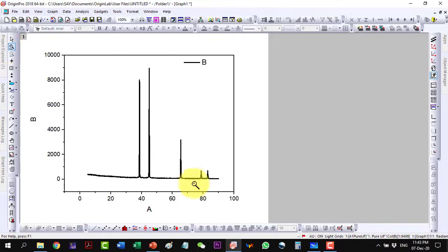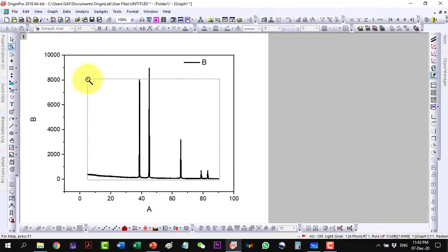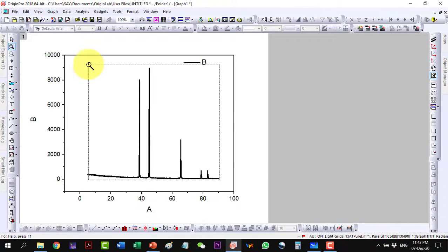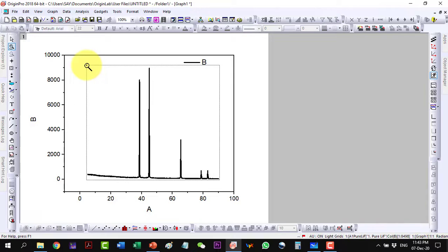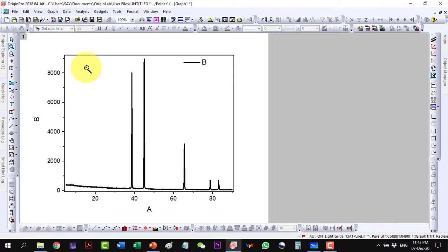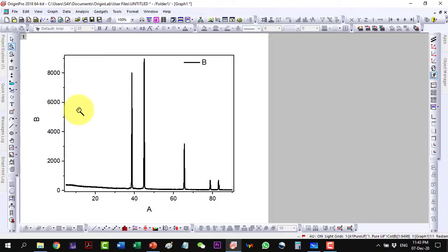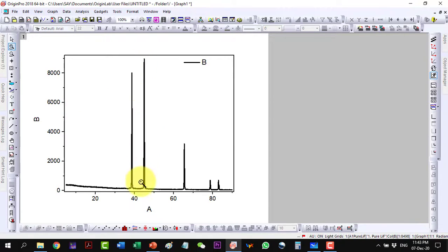I will have to only focus on the data so I will zoom this portion in order to have a good view of it. And as we know, in order to find the crystallite size, the FWHM we calculate from the maximum intensity peak.